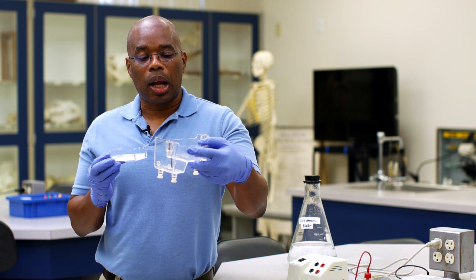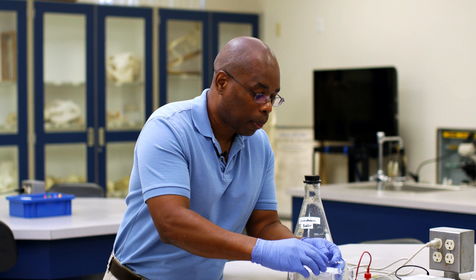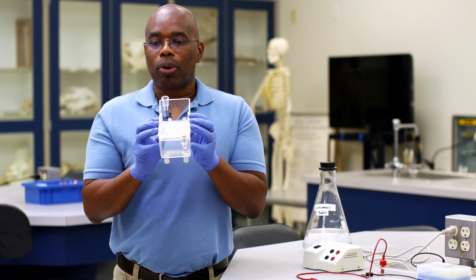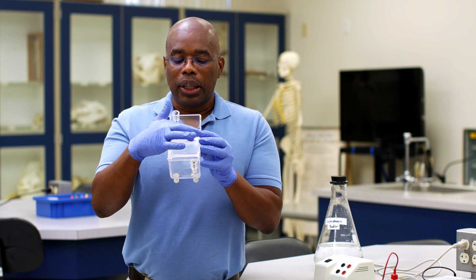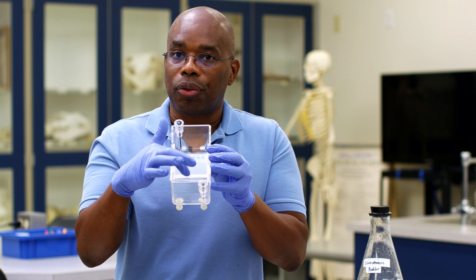You see this little indentation in our apparatus — it should line up with the notch in our gel, and we're going to end up with something that looks like this. The reason we want the proper orientation is that we're trying to get our sample to move from one end of the gel to the other. Our DNA is a negatively charged molecule, so at the top it is exposed to the negative electrode and the bottom is the positive electrode. Opposite charges attract and same charges repel, so we repel the DNA from the negative end and pull it toward the positive end so it migrates through the gel.